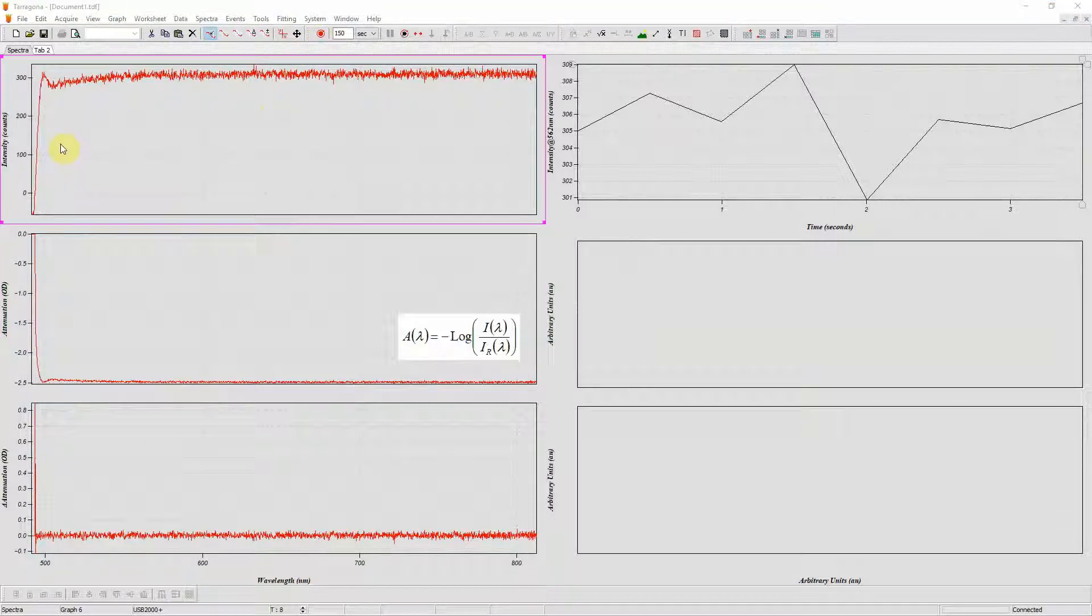This is the black level of the black spectrum and I need to measure it and then subtract it off subsequent spectra.